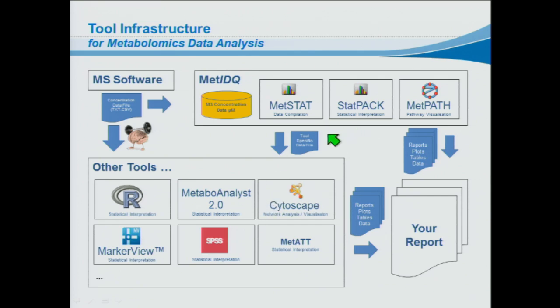And whatever tool you need or want to use, you get out your plots and your tables of data, which you then combine in a report.